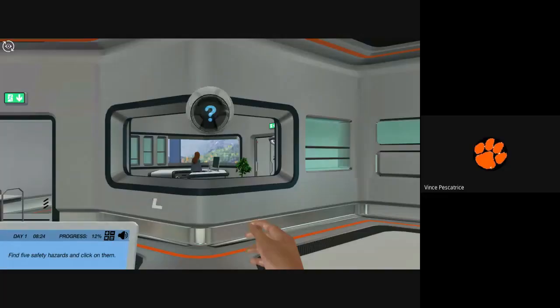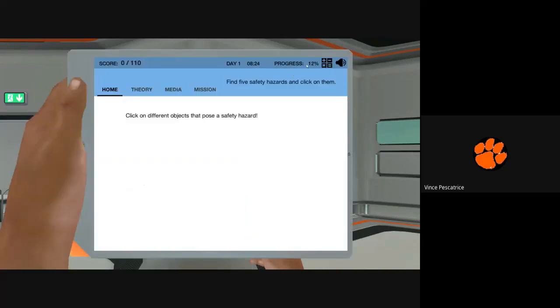Okay. So once you're done and you need to screenshot your progression. I know mine says 12, so I know that should say 100. What you're going to do is type in the search bar down at the bottom. Let me share my entire screen instead. It'll be a little easier. You should have a search bar at the bottom of your screen. Type in there SNIP, S-N-I-P.